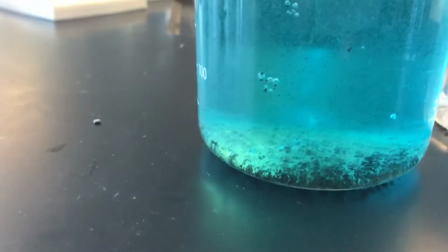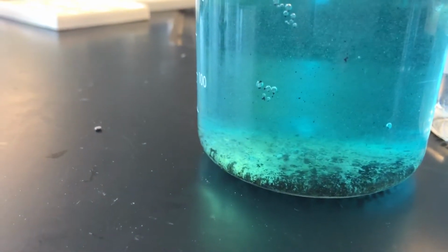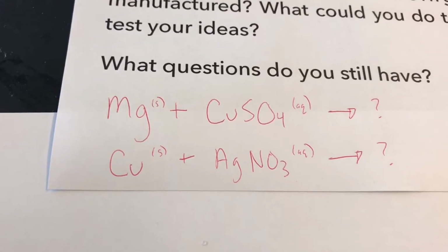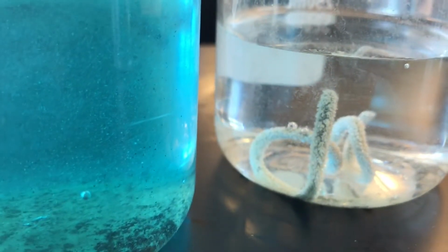And now you have like this weird solution that isn't just copper sulfate anymore. All right? And so that is now our after picture. So take a look at the reaction, and what do you think is the identity of the substance that was being manufactured?